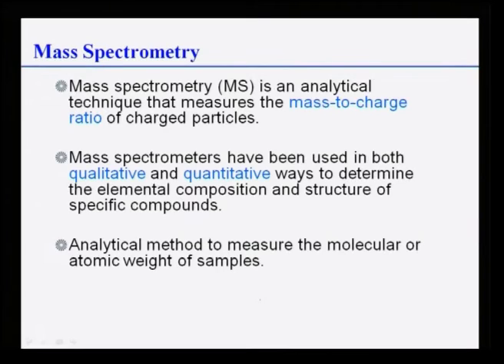Well, what is actually mass spectroscopy? You must know that first. Mass spectrometry or mass spectroscopy is basically an analytical technique, like any spectroscopic technique, but it measures a different thing. It measures the mass to charge ratio of any charged particle. You must remember this: mass spectroscopy doesn't measure mass. It measures the mass to charge ratio of any charged species.